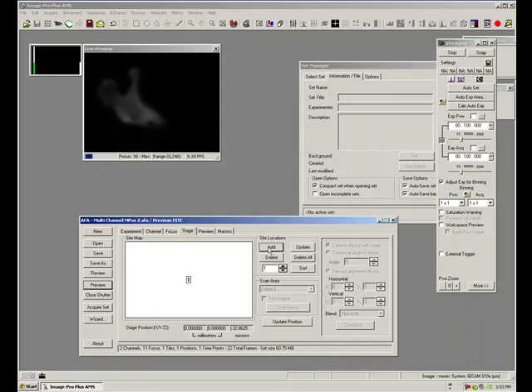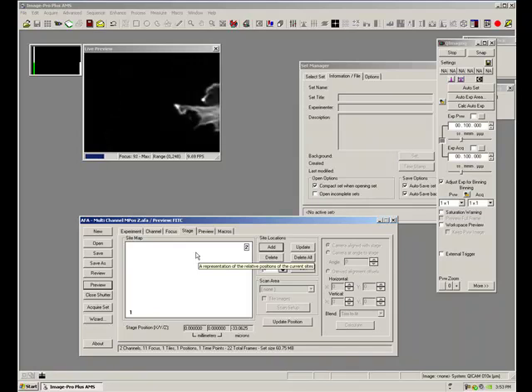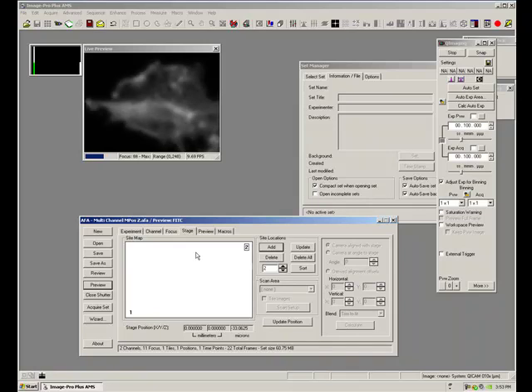And I can focus in on that if I want. Cool. And let's do another one. I can do a lot actually. One thing that's really nice is if I was doing a well, doing multiple positions, I can actually do these positions and actually do a little tile at each position as well.